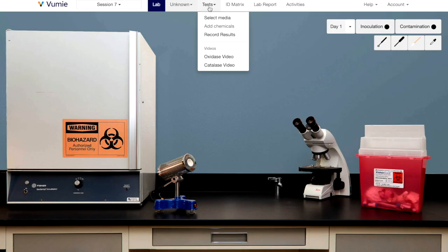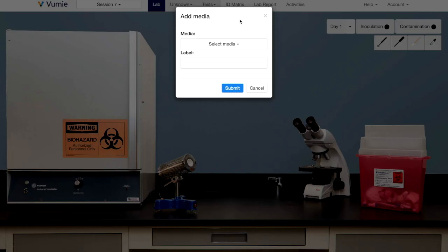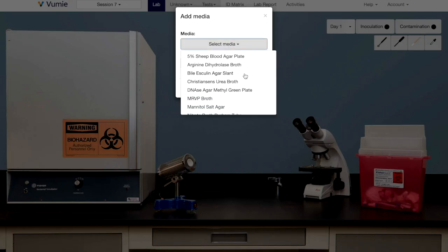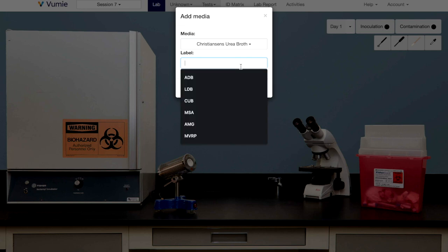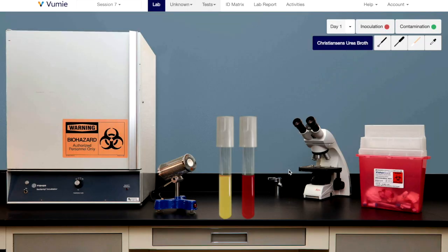Here's what it looks like in the virtual lab. Select the medium to be inoculated. It will appear along with a pure culture of inoculum on the lab bench, inoculum at the left and sterile medium at the right.